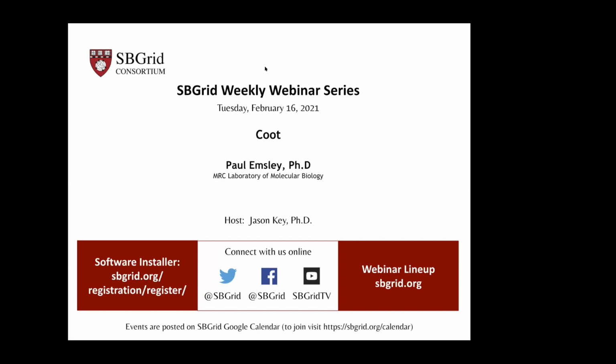So on that note, Paul, thank you for sticking around late and agreeing to give a presentation today. I think we're all excited to hear what's new in Coot. I didn't give you a title, but that is exactly what my title is. I feel like that could just be the standing title. Well, it has been for the last 15 years.